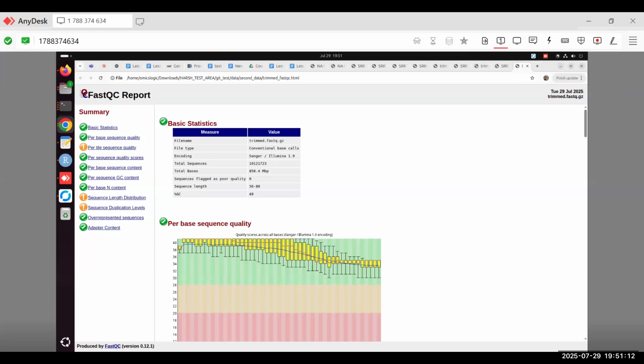Some use one. The basic threshold is that you should have a log fold change of 1, at least 1. And then according to your data, you can change it to 2 also, 3 also. But if we increase the threshold for the log fold change, that means we are moving towards a hard filter. So you can initially begin with 1.